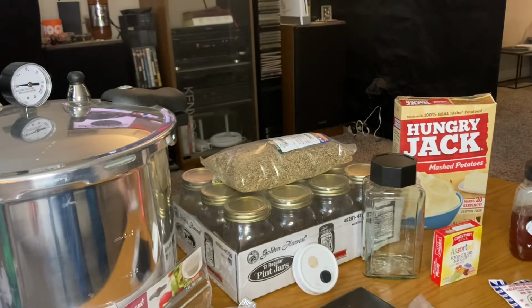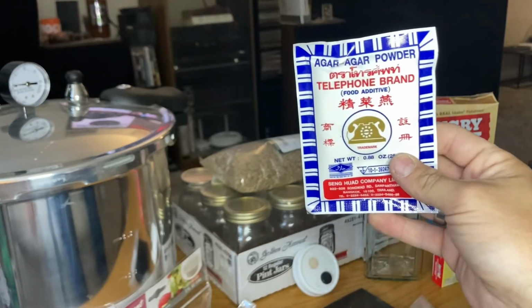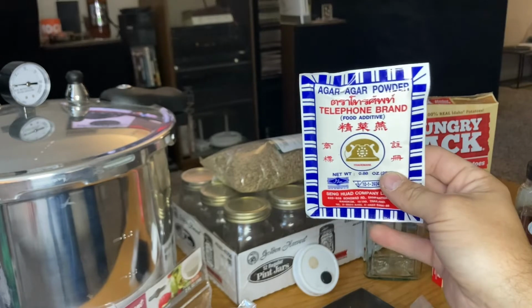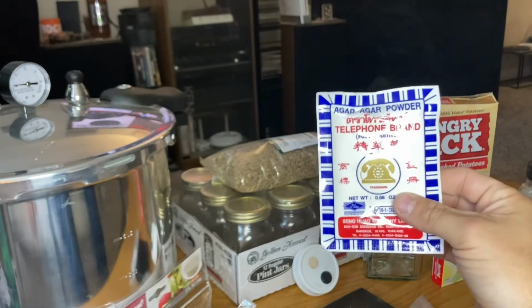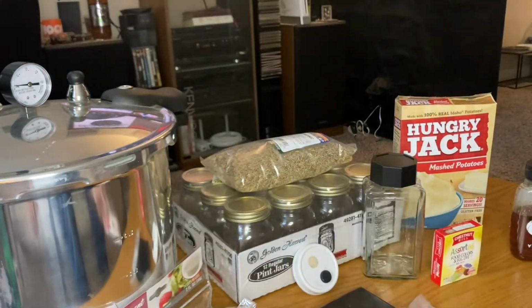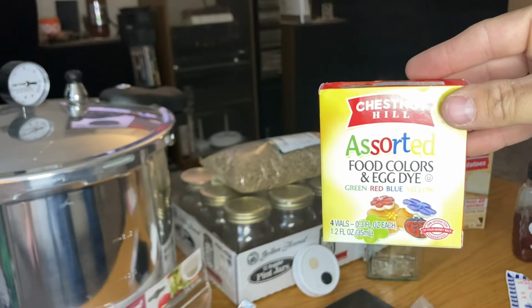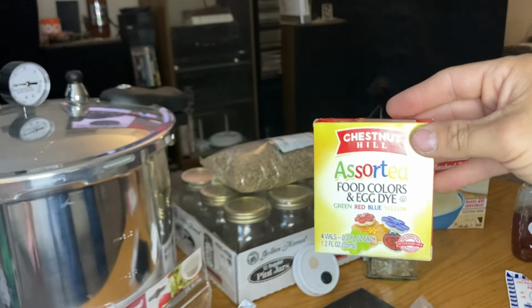First, you're going to want some Telephone brand agar powder. You can usually find this at any of your local Chinese stores or any of those kind of ethnic stores that might be in your local area. They'll usually have these for $1 or so a pack. Very, very cheap. Then you're going to want some food coloring. This one is optional, but it will help you spot contamination a lot faster. So some food coloring is good.